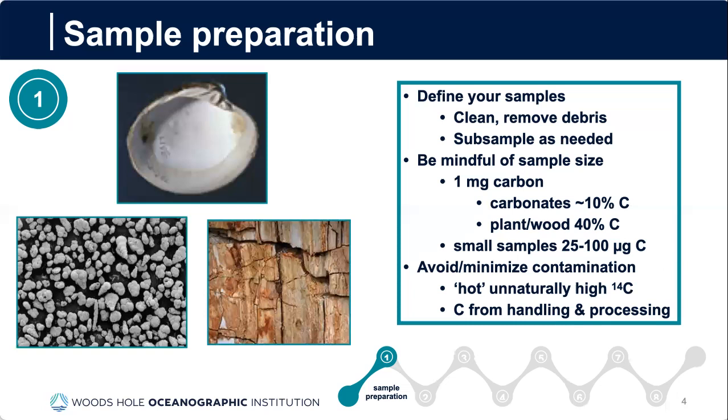It also can have an impact on the samples from other clients that may have been processed at the same time as your hot samples. So we must be careful to protect our facility, and all, I imagine, natural abundance radiocarbon facilities are struggling to always protect their facilities from contamination.